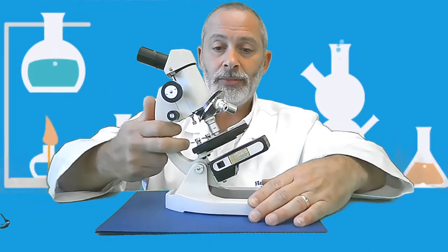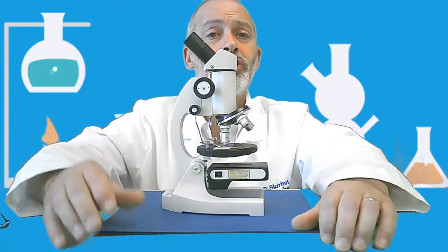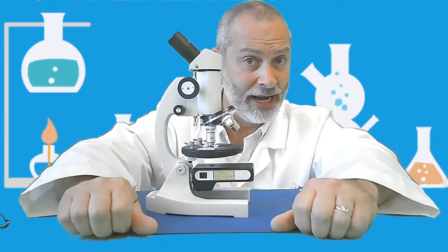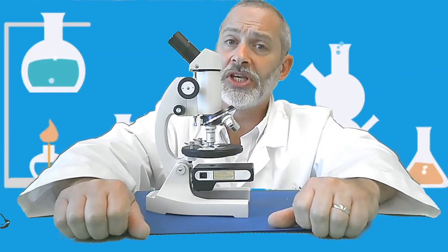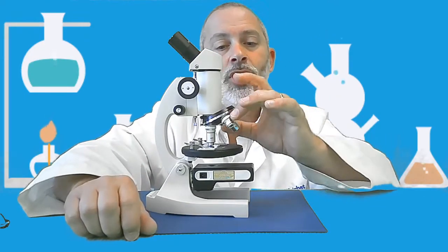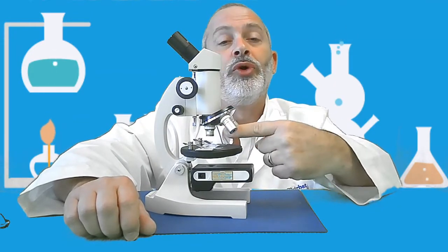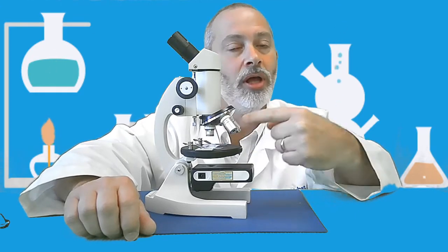Next, you can actually reposition the arm. Make sure the microscope is in the upright position, just like if you were on an airplane ready to land and you are asked to put your seat in the upright position. Please put your microscope in the upright position. Next, rotating the nose piece, return it to the low objective power.